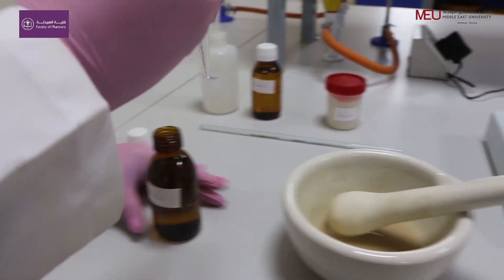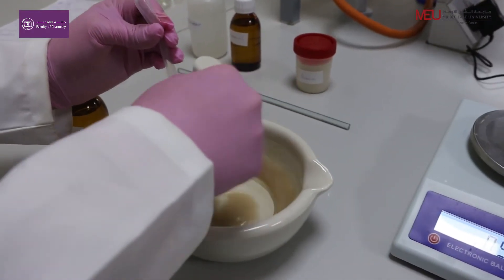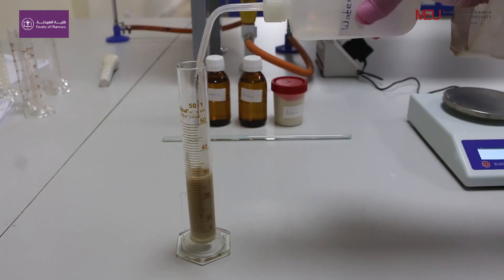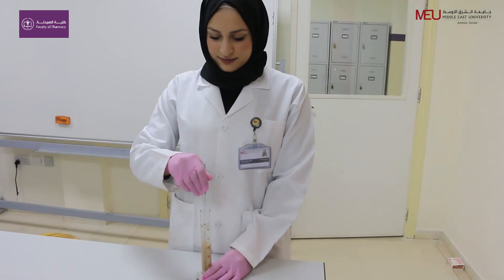Add 1.8 ml of alcohol to the emulsion formed and mix. Transfer it to the calibrated bottle and complete the volume to 30 ml. Mix until the mineral oil emulsion is formed.